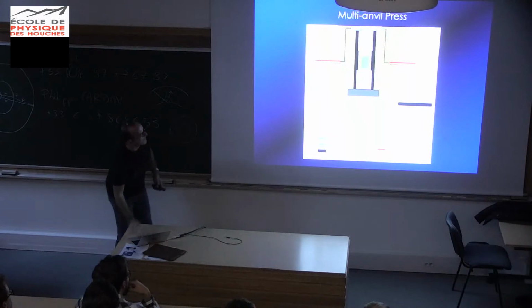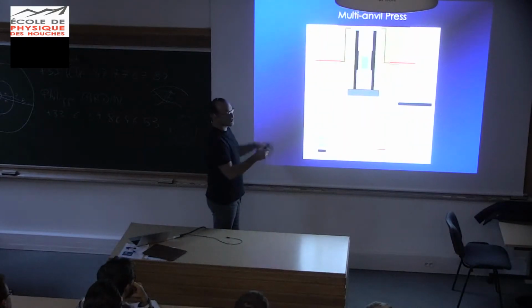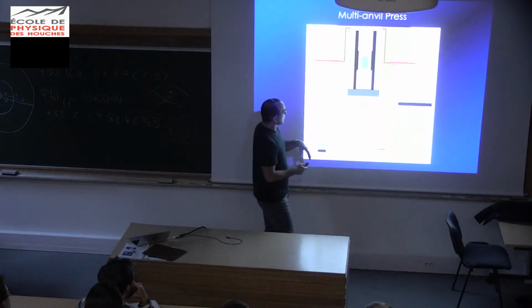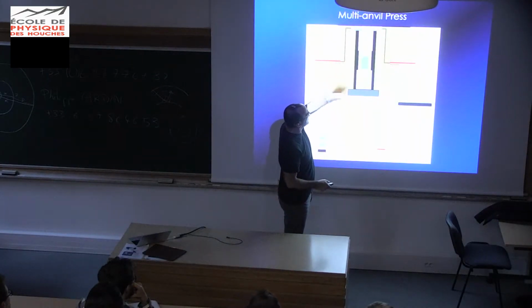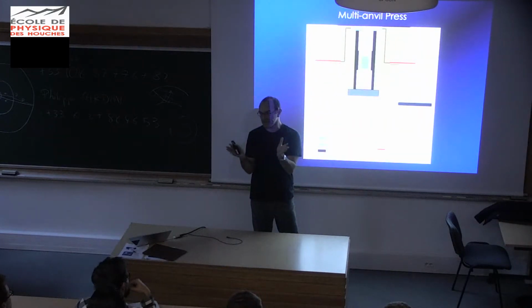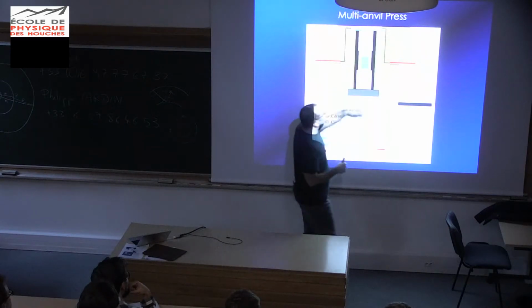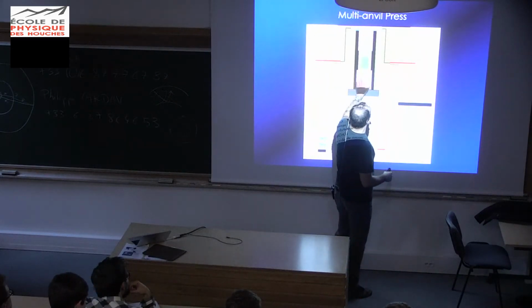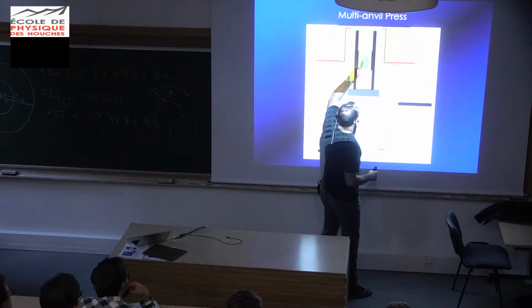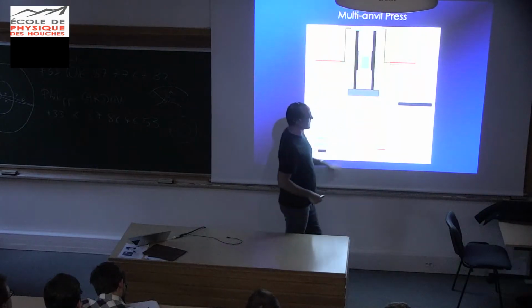Okay, so this is the octahedron, which contains your sample. So it's made of magnesia, and inside of this you recognize something that in principle is essentially similar to what we had in the piston cylinder press. Okay, so you have the furnace, an insulator, the sample, a capsule around the sample, a thermocouple. It's basically the same thing.